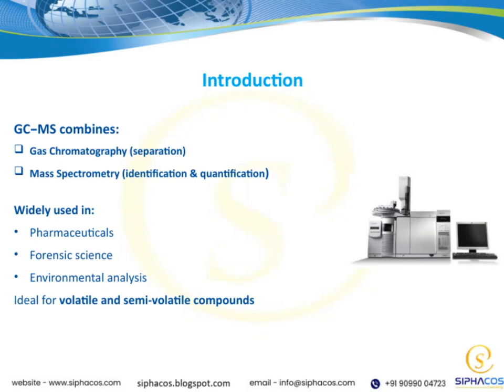Let's start with the basics of GC-MS, which is a powerful analytical technique that combines two main components. First, we have gas chromatography, or GC, which is responsible for separating the different compounds in a mixture. Then, there's mass spectrometry, or MS, which is used for identifying and quantifying those compounds once they've been separated. This combination makes GC-MS incredibly versatile and widely used across various fields.